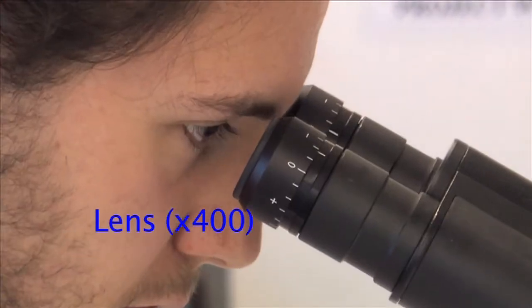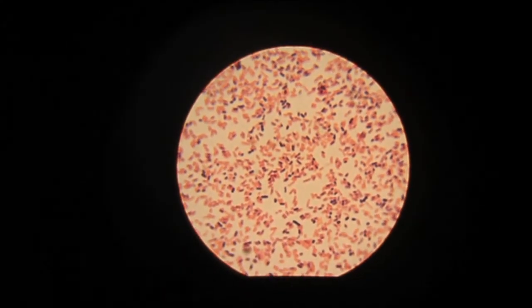Again, the next lens along is the x400, with the blue stripe lens.